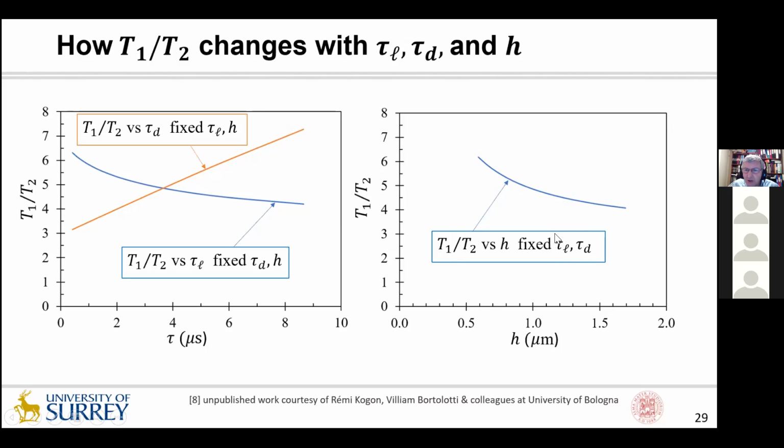So the time constants here are constant. So the CSH water interface in both these cement paste and the mortar is the same. They have the same tau L and tau D. It is H, the physical size on average of the pores, that's leading to a reduced value of the ratio for the case of the mortar.